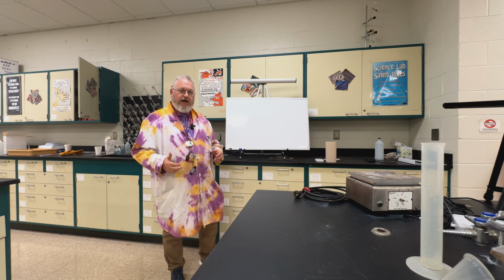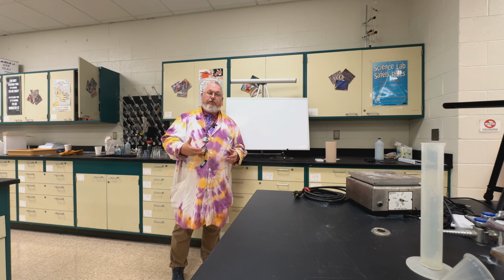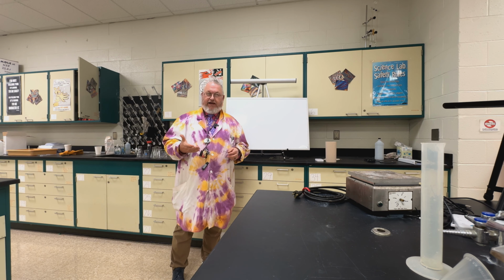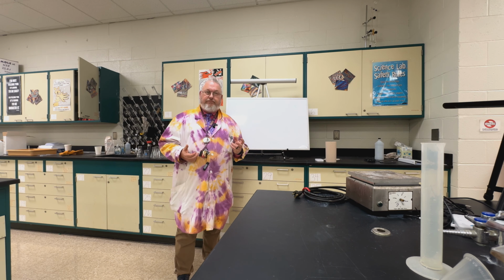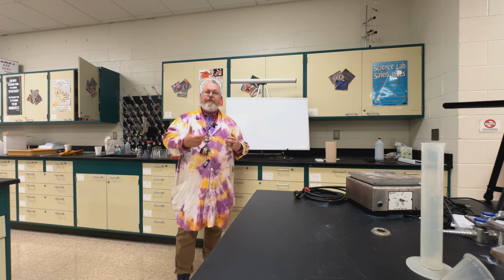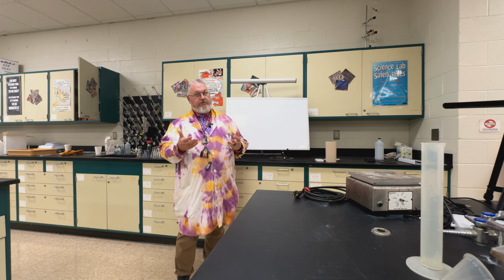This is Coach Scott with another edition of Purple Wave Chemistry, and today we're doing a pre-lab, if you would, prior to what I like to call our Icy Hot Lab. In this lab, we're going to take a beaker of ice and heat it up with our temperature probes until it melts. Then we're going to keep heating it until it changes into water vapor, otherwise known as boiling.